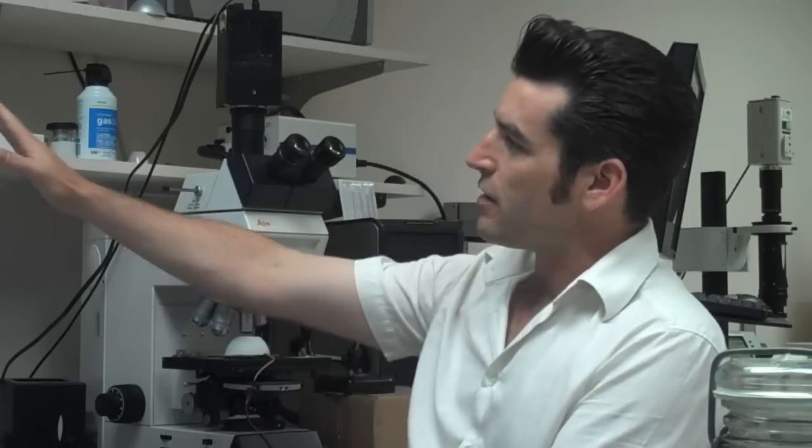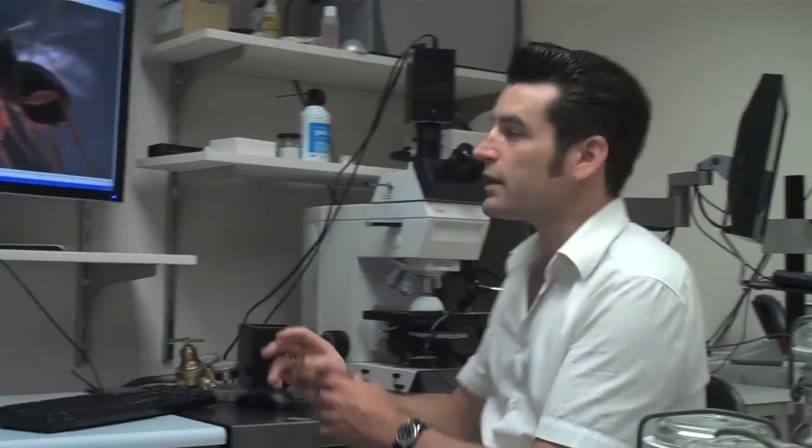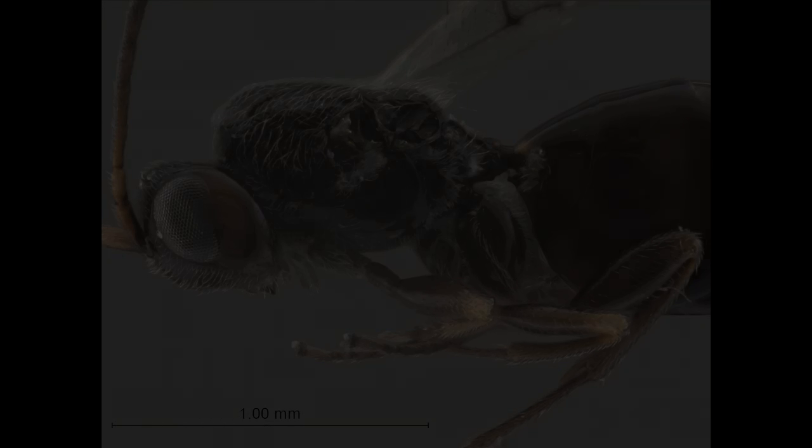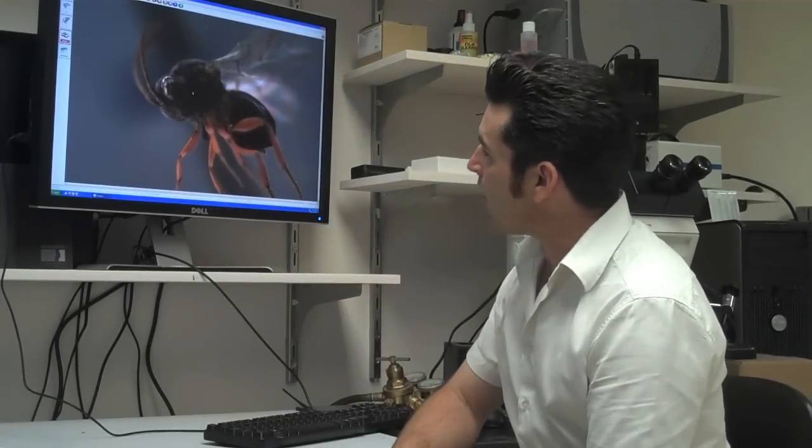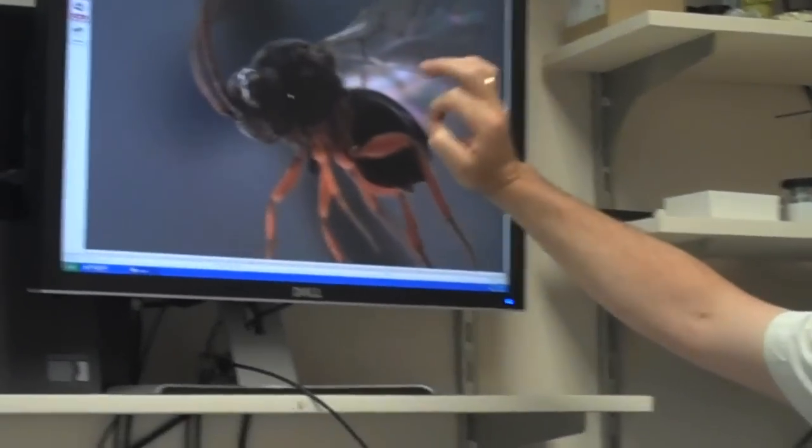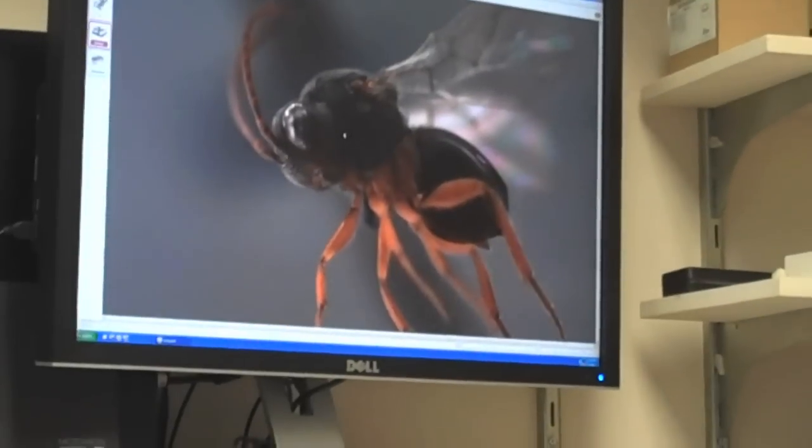What I've got up here on the screen is the same species, same specimen that we had in the other system. But the resolution of certain key structures on this part of the thorax, now I can actually see them. I can actually see the individual ridges, I can see how each individual hair pops out of that ridge.